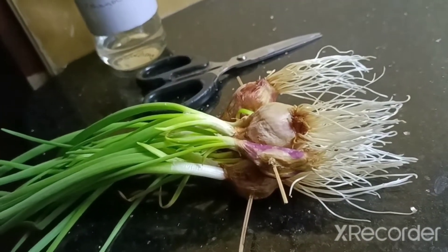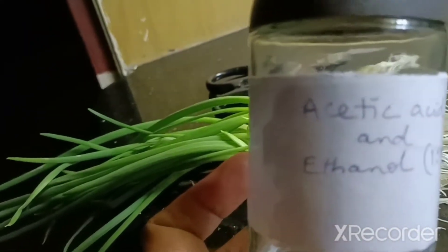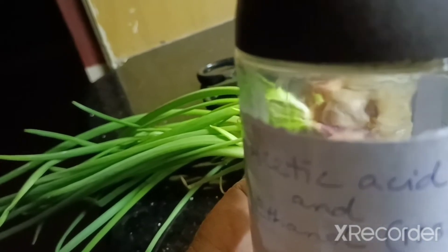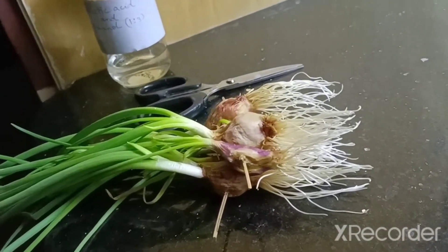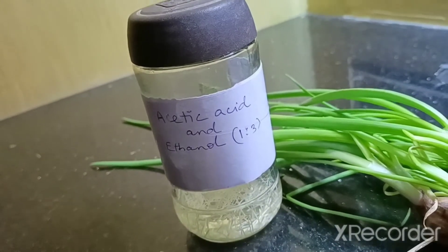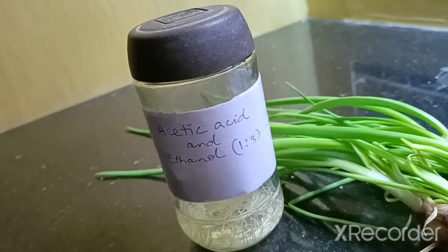From here we have to trim the root tip, about five millimeters in length. It can be trimmed and put inside a solution — make sure it contains acetic acid and ethanol in a 1:3 ratio. The root tips have been trimmed and kept inside the solution, and this process is called fixation.